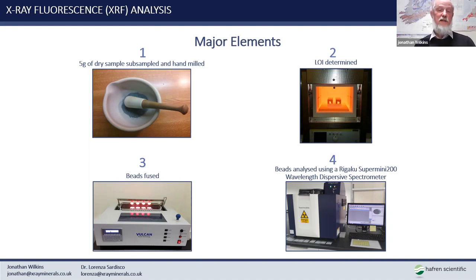An electric motor agitates the crucibles to make sure that the contents are well mixed. And after about 15 minutes of roaring gas flame, the preheated molds are then filled by simply lifting the whole row of crucibles, which you can see glowing away merrily at the back of the machine, and tipping them out over the weighted molds, which are waiting here and are also at a nice bright red heat.